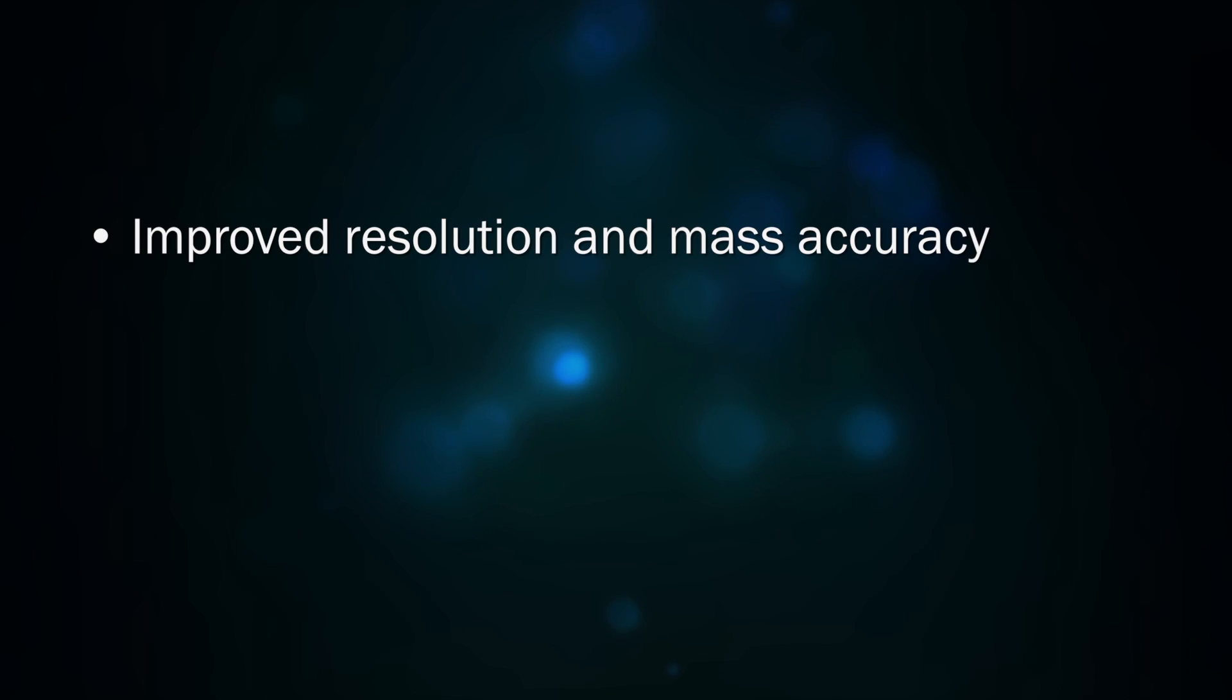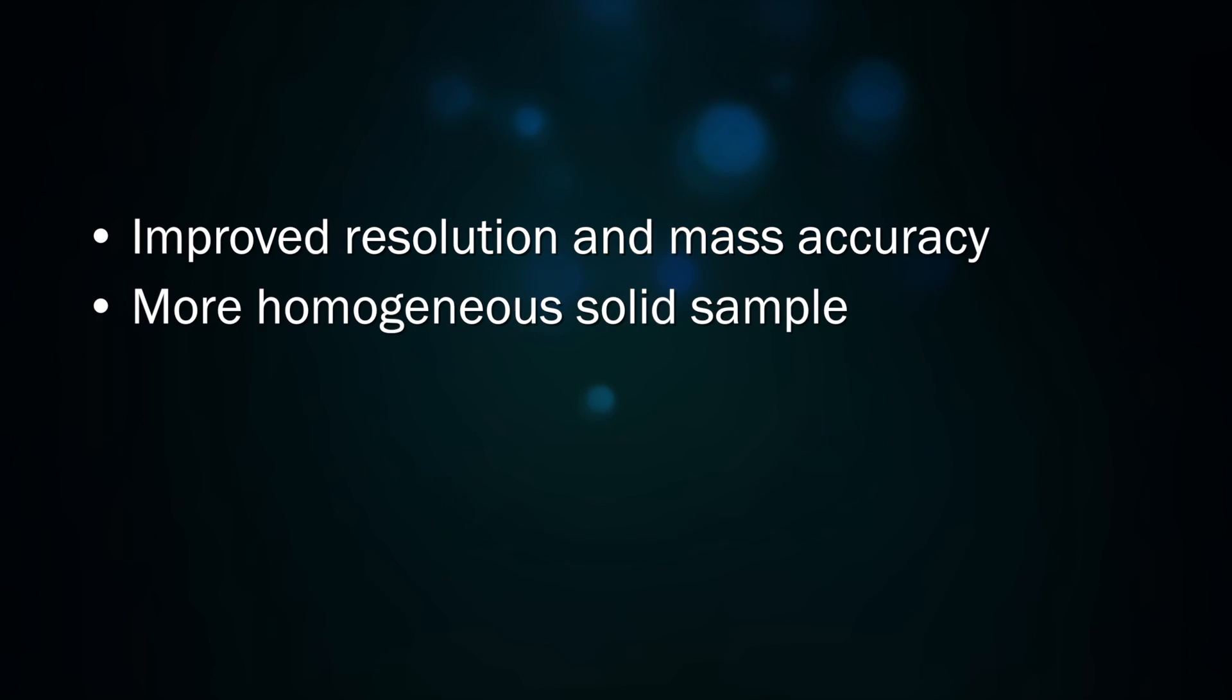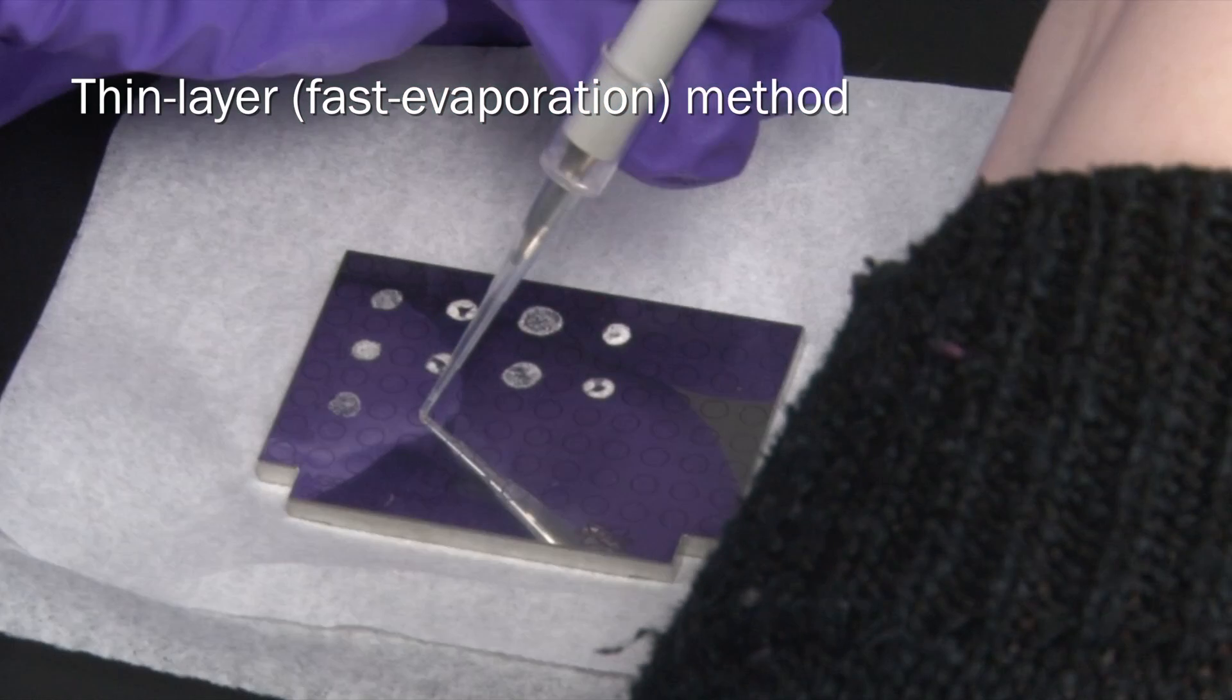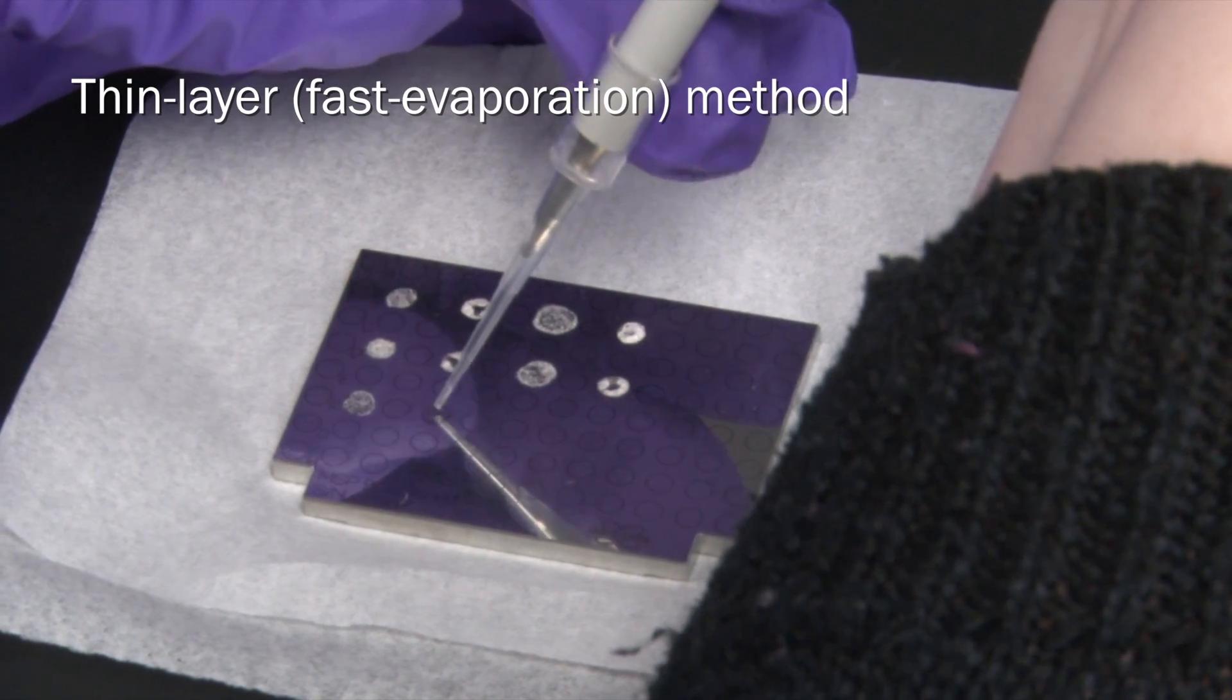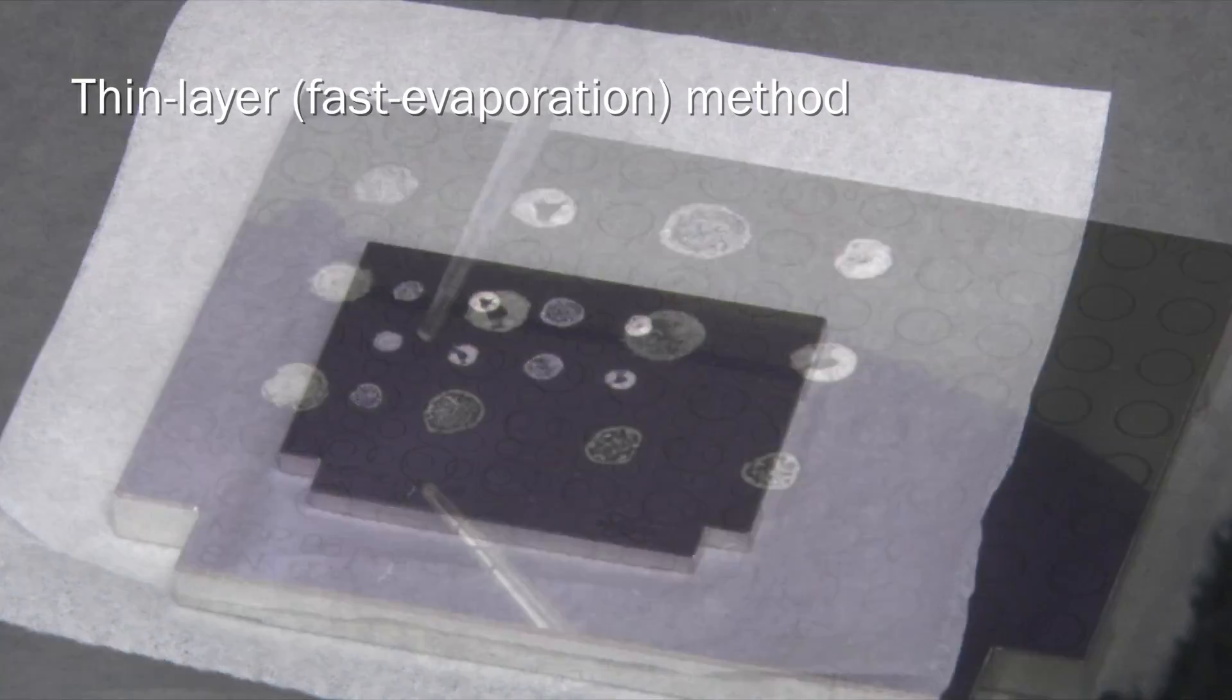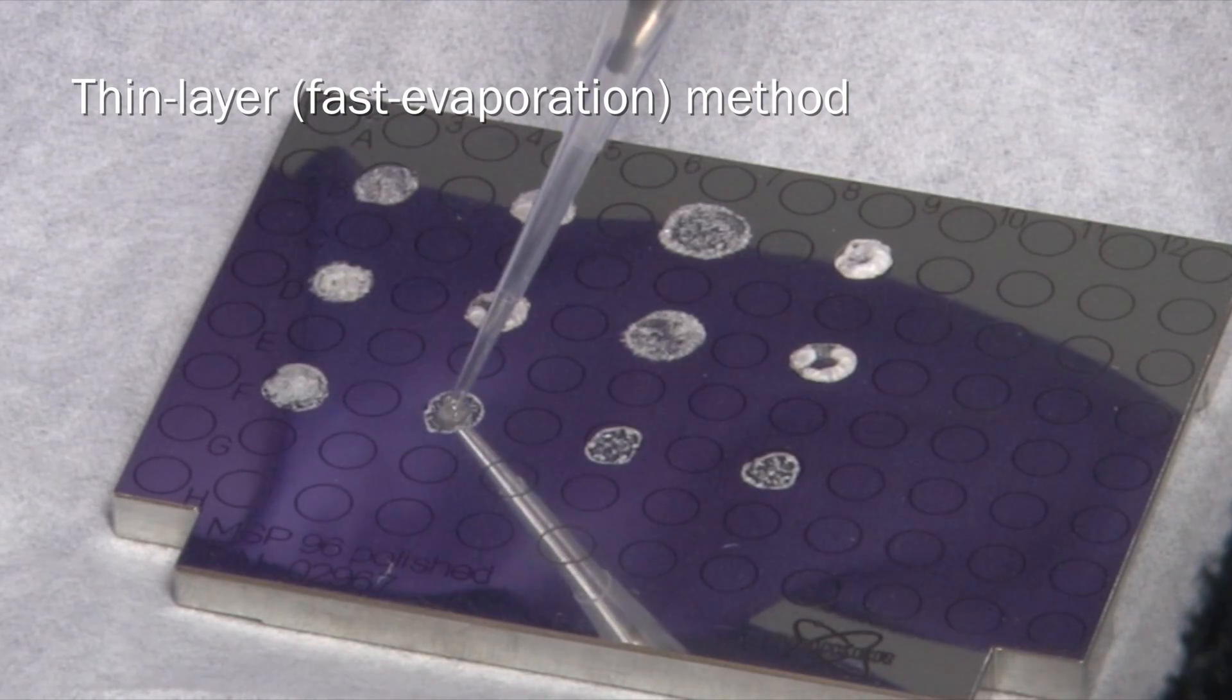In samples where the resolution and mass accuracy are critical, sometimes improvements can be found by making a more homogeneous solid sample. In the thin layer, or fast evaporation method, the matrix and analyte are mixed into very volatile solvents such as methanol or acetone. The matrix is first applied and allowed to dry into a very thin, uniform layer. The analyte solution is then applied on top of the dried matrix.